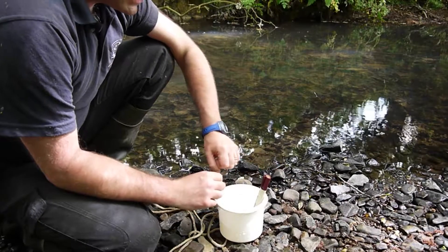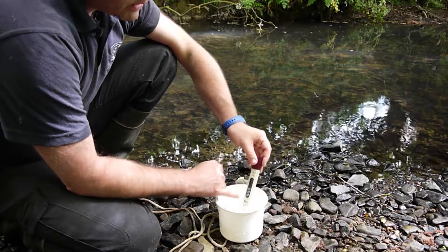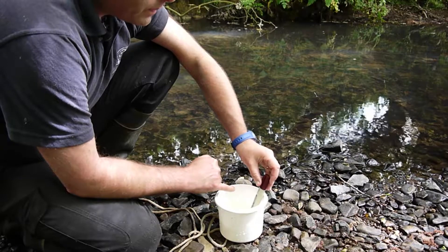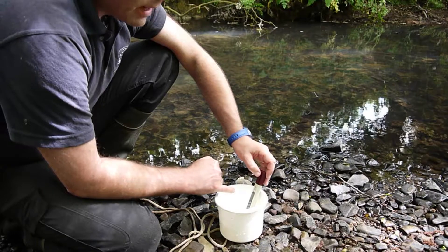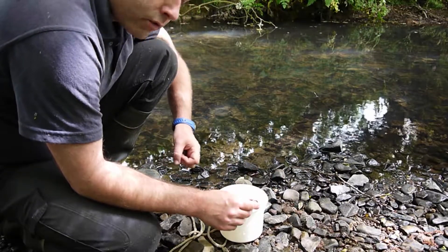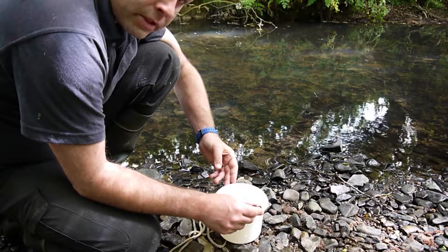Once we've done the turbidity test we only need a little bit of water — about two inches in the bucket — because it's important that this device doesn't get wet beyond the screen. You really want to keep the water level down to about here. It's been sat in there for a couple of minutes now because I want to make sure the temperature settles down to the water temperature, which has come down now to 17.1 degrees.